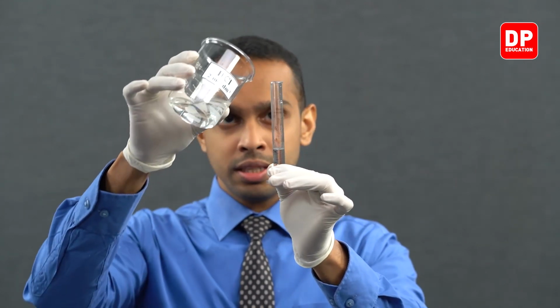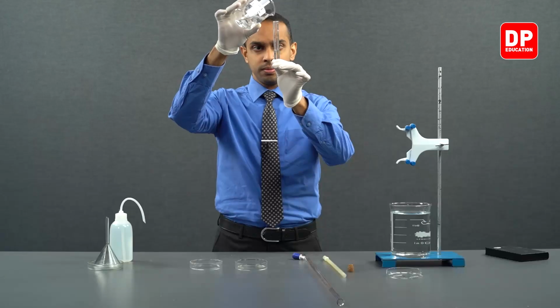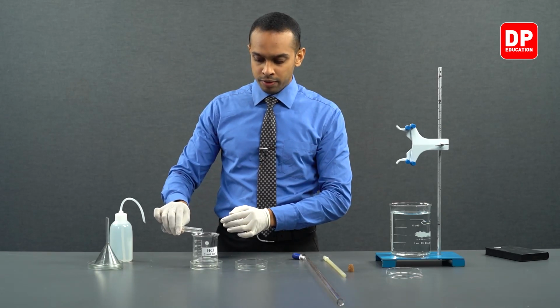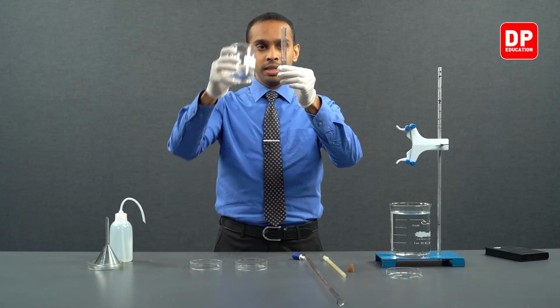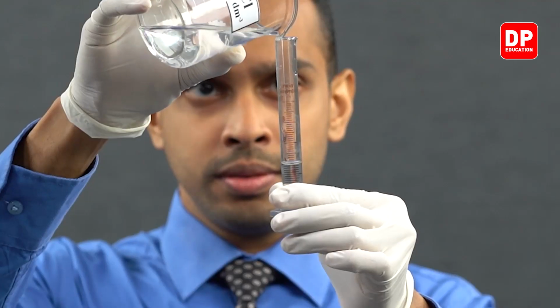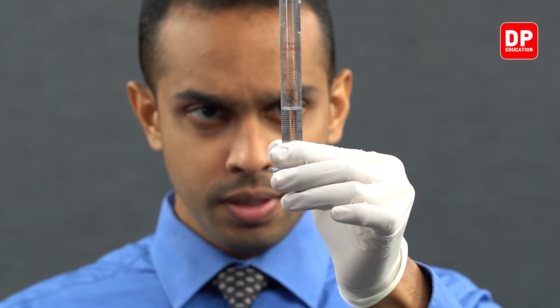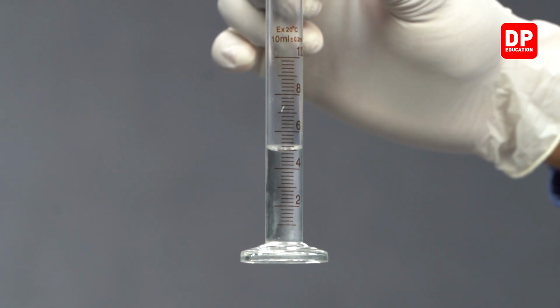So after bringing it to my eye level, I will add the right amount of HCl until the meniscus aligns perfectly with the 5 milliliter line. Now the meniscus aligns perfectly with the 5 milliliter line.